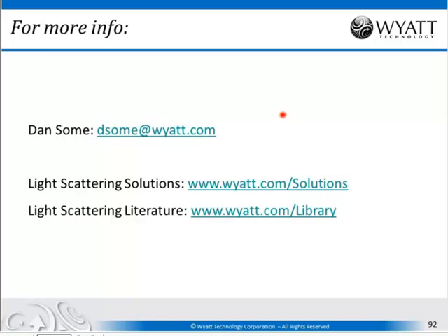All right. Can you perform protein conjugate analysis when the modifier is a small molecule? It really just depends on the total added molecular weight. So if you're adding enough of that small molecule, then the answer is probably yes. Again, it just needs to reach 3 to 5% of the total molecular weight. Okay, and it looks like we have time for just maybe one more question. What temperature range can be screened with the DLS plate reader? 4 to 85 degrees. Oh, that was fast. We have time for a couple more then.